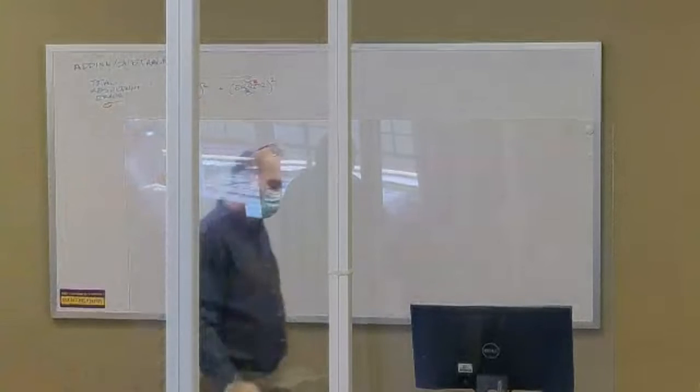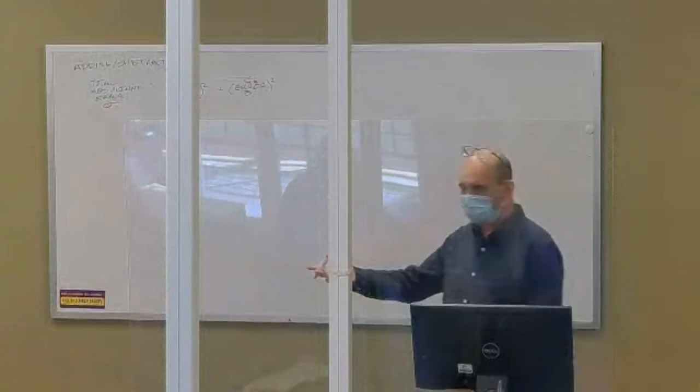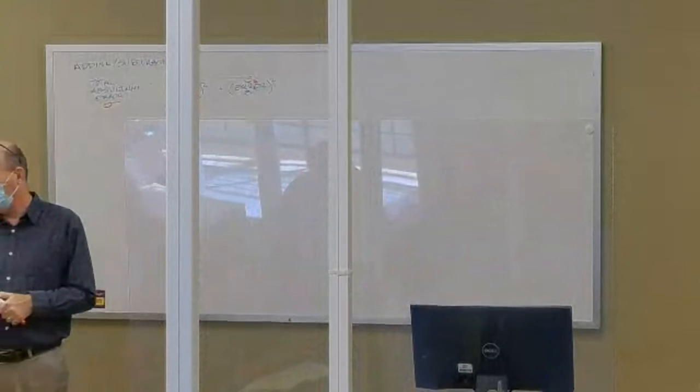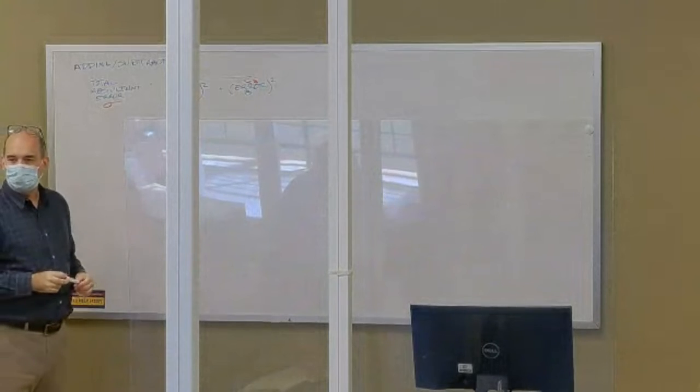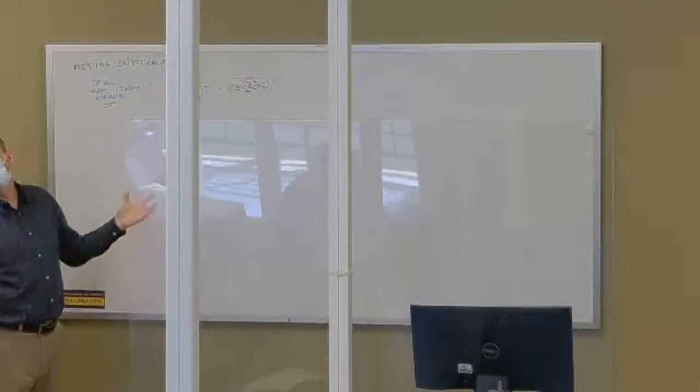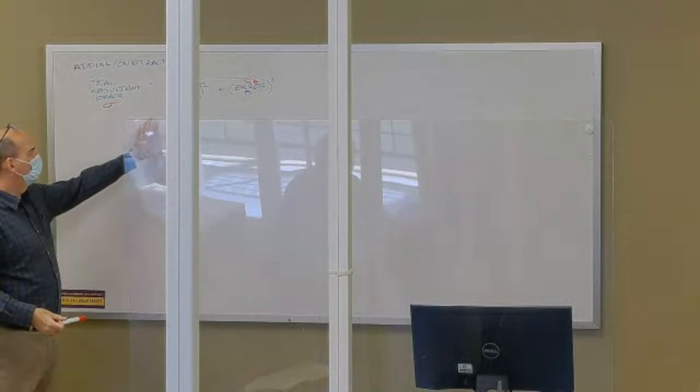That's your plus or minus. That's your margin of error in a volume that is printed on the pipette. It is the value that your balance tells you. I can weigh this mass plus or minus this amount. Okay.